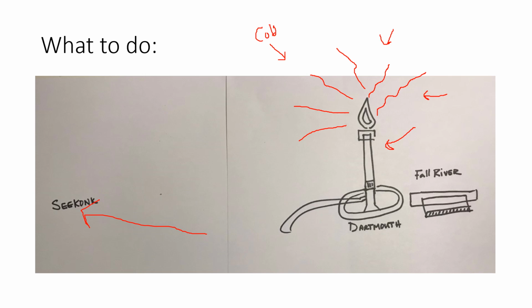Something else that I'm kind of particular about is I want to keep my fingers away from the openings on the plate. I don't want to leave bacteria there because the bacteria will be that much closer to the agar and contaminating my plate.